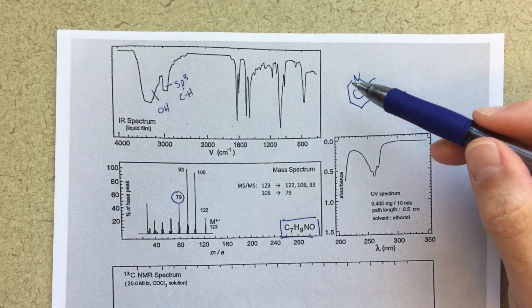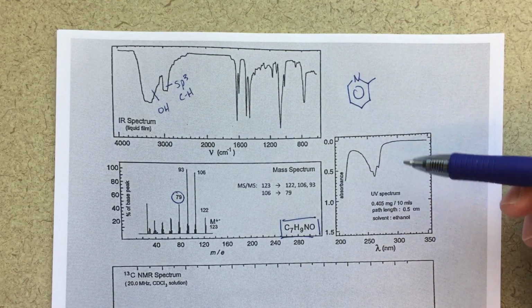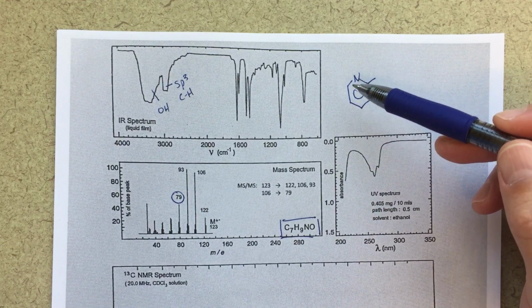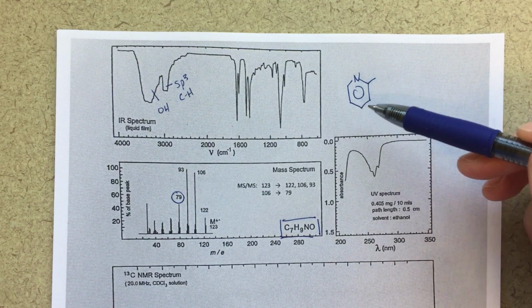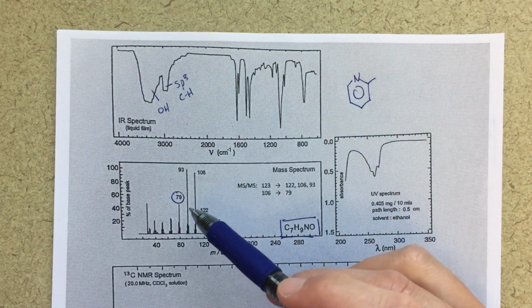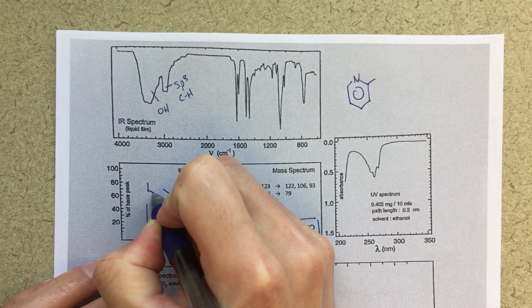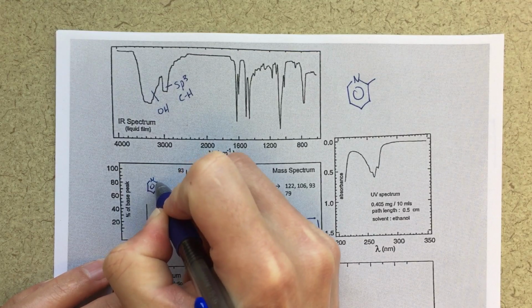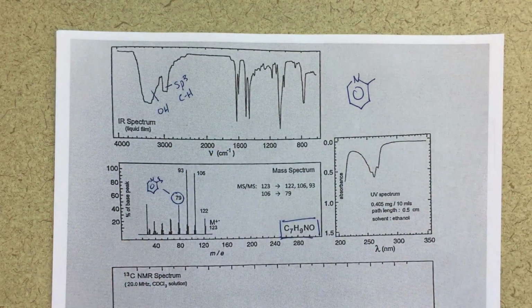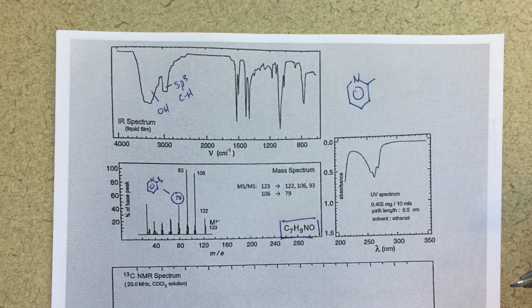So some ring with a nitrogen, right? So I've got my sort of pyridine ring here. I've got my nitrogen. And from this picture here, this fragment is going to weigh 79. So this 79 fragment is a fragment that looks like that. That will equal that mass of 79. So I think that that's a good sort of starting point.